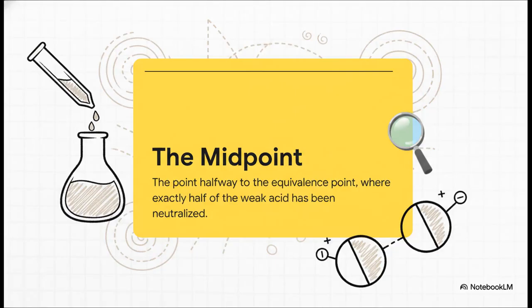Now, see that flat part, that buffer region? There's a secret hidden in there, a really important spot called the midpoint. As the name suggests, it's the exact point where we're halfway to the equivalence point.